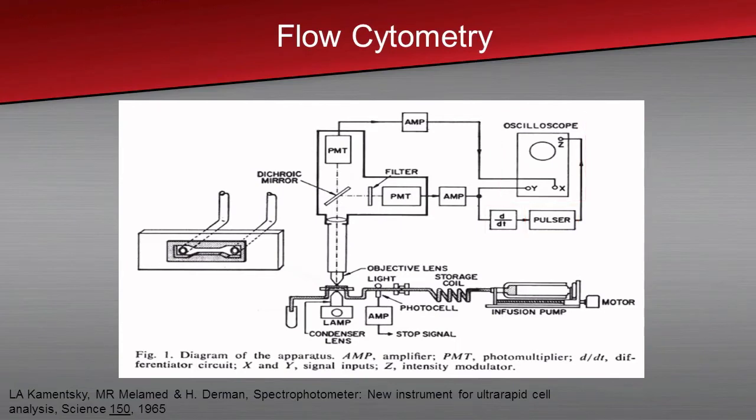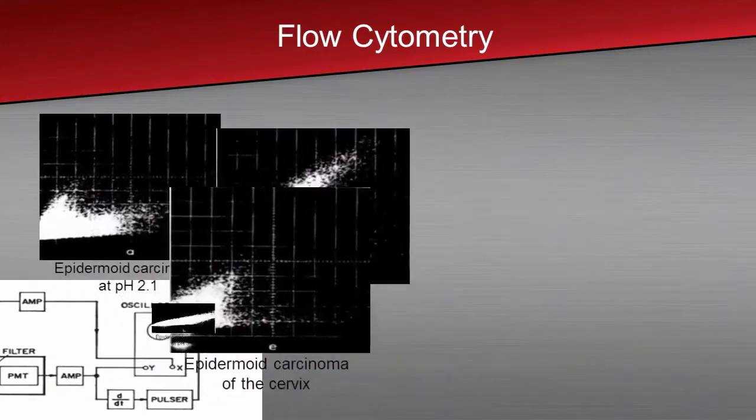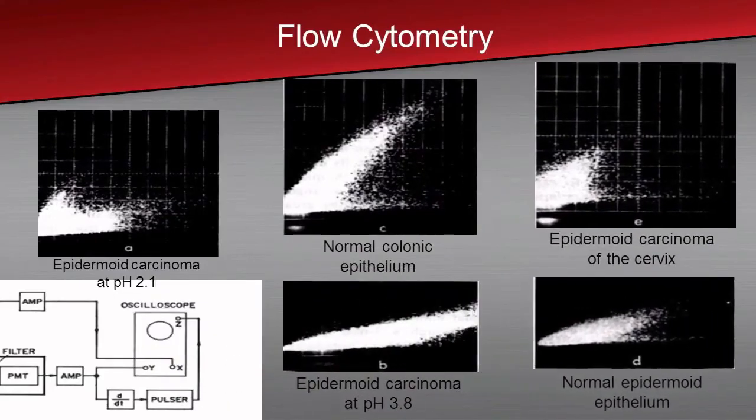Again, I think the invention here is correlated measurements, being able to measure 2 different constituents at the same time and produce the display like this. Later on, these dot displays were very difficult to talk about. Back then, biologists didn't know 2-dimensional things.